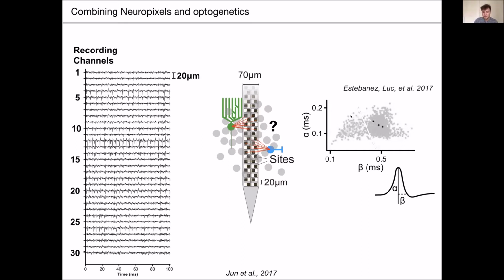And you end up, in general, with a big blob like that. You can try to find clouds which are independent from each other. You can try to run different clustering pipelines in this feature space, but really, clustering is an art, and it's really dependent on the set of features that the experimentalists will decide upon. What you want, to be able to make convincing arguments, is some ground truth data. You want to be able to tell that this neuron up there in the corner corresponds to a big projection neuron or a local interneuron.